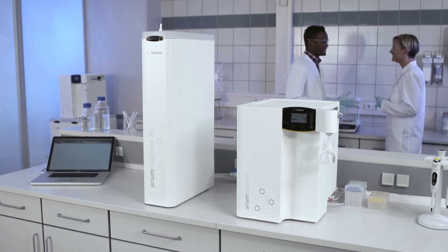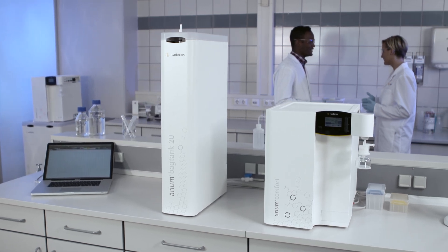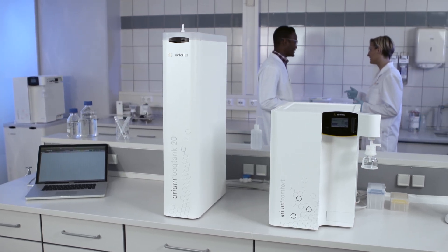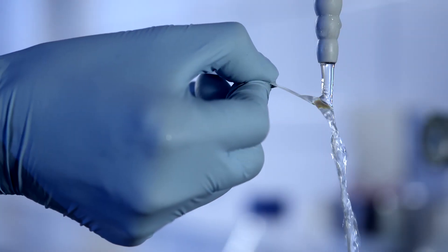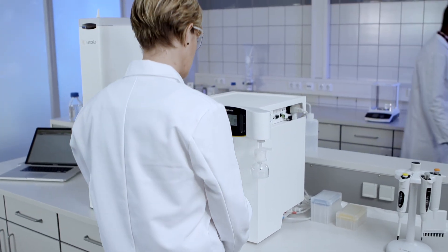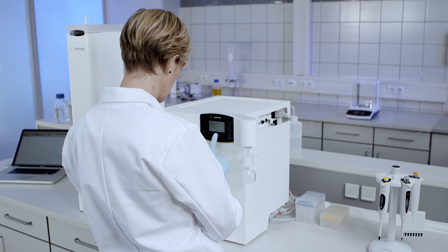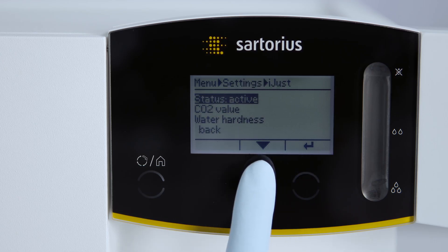All REM systems offer the customer a wide range of application options, ease your daily workload, and can be perfectly integrated according to your needs into your laboratory. Thanks to the innovative and unique iJust function, you can use your resources optimally. The technology takes your specific input water characteristics into account and optimizes the water usage.